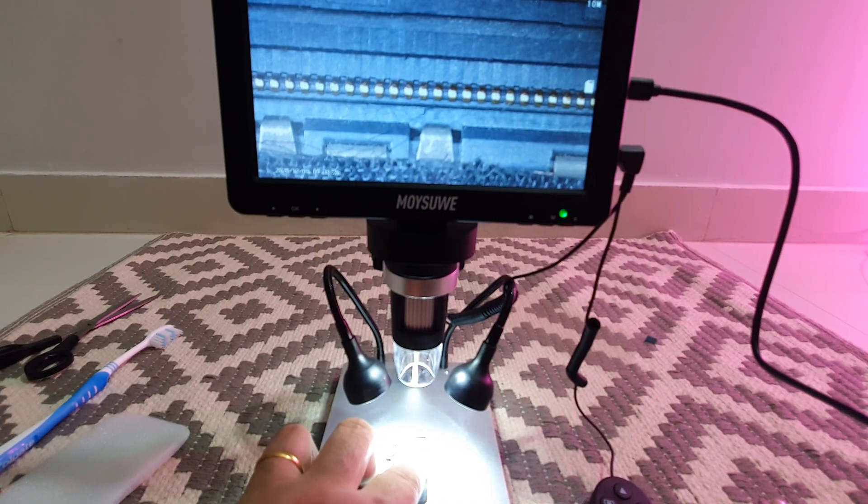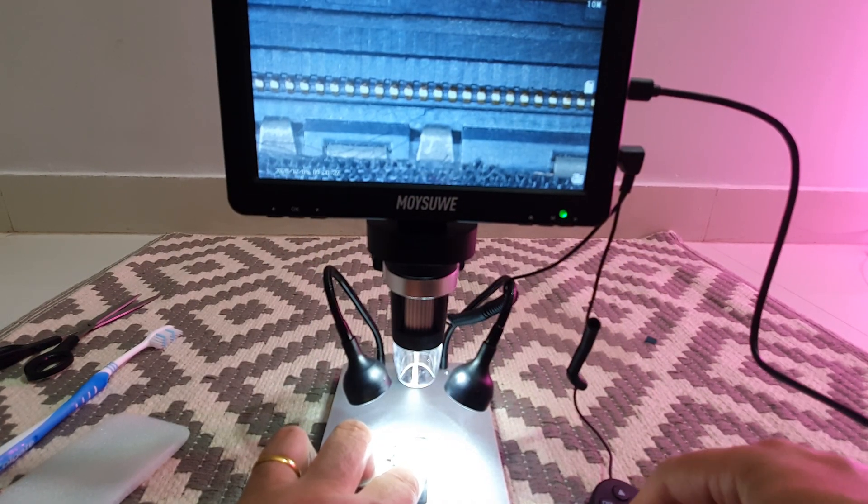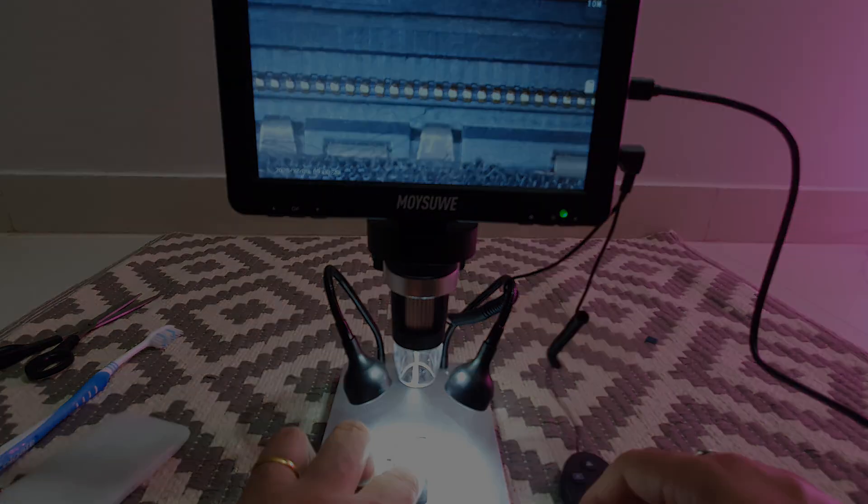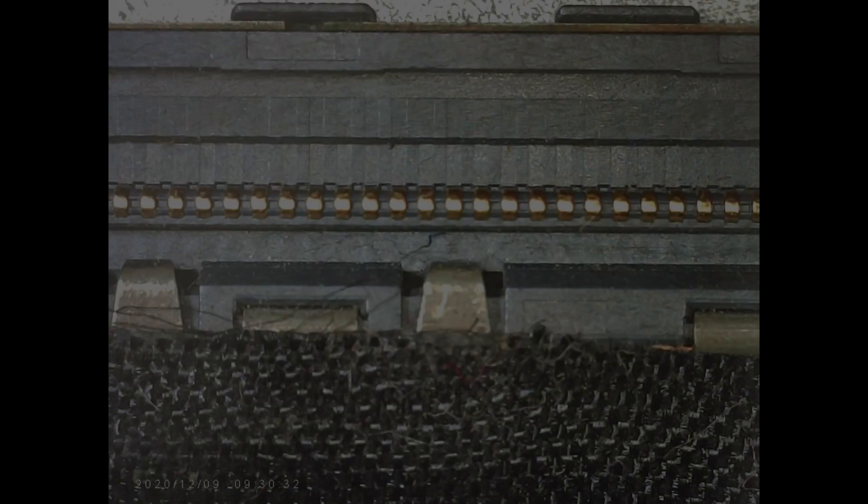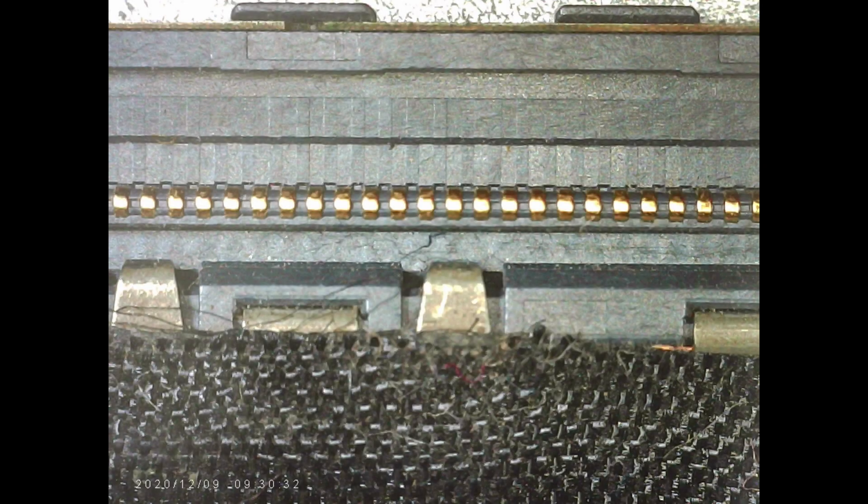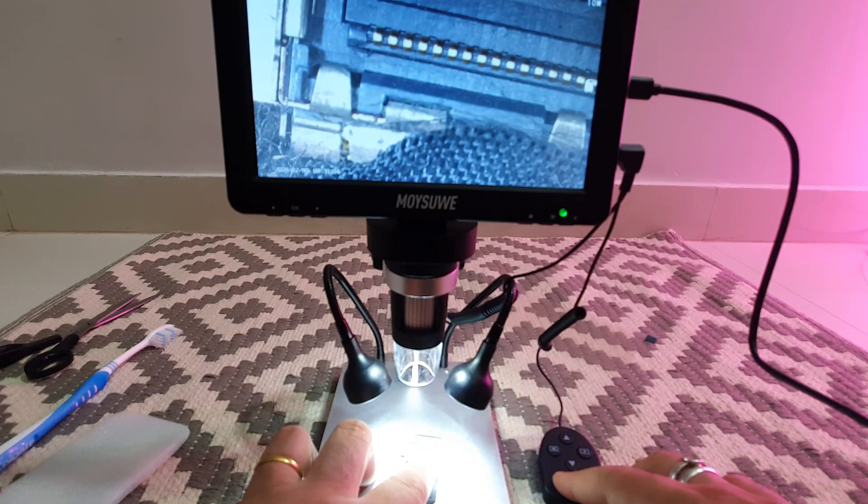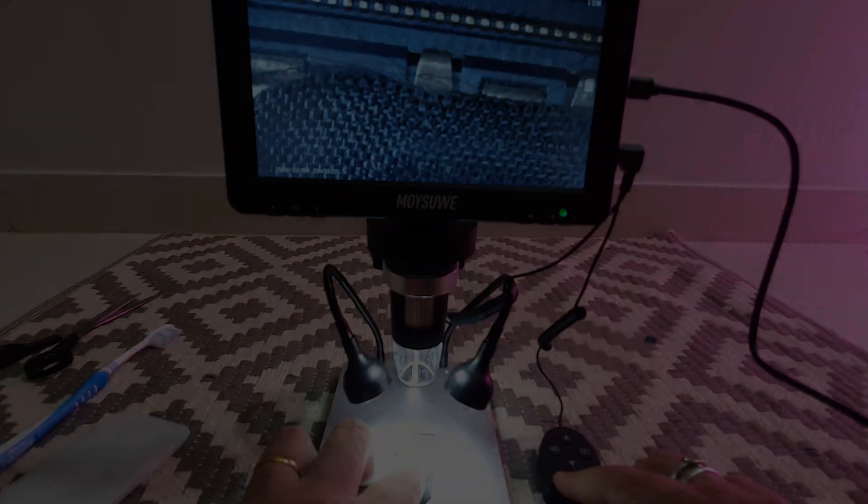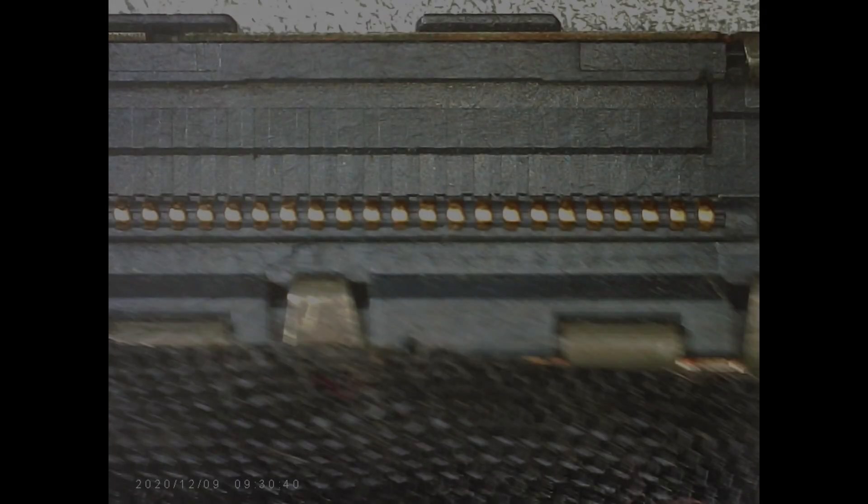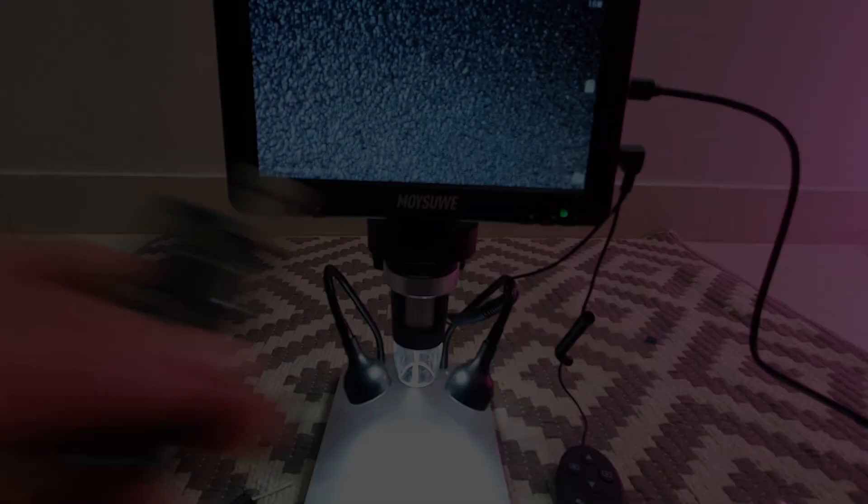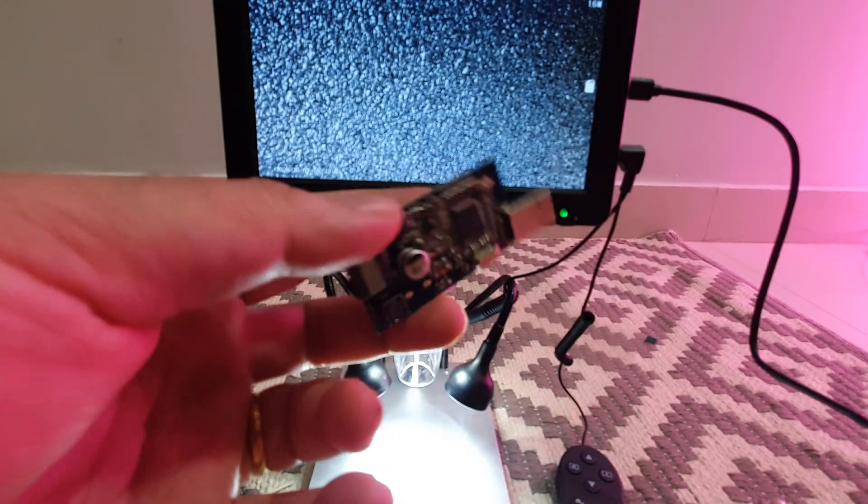This is a cable which is used to connect your monitor internally in a laptop, LVDS. I can't remember the term but you can actually look at all the teeth on this thing. This is really small.